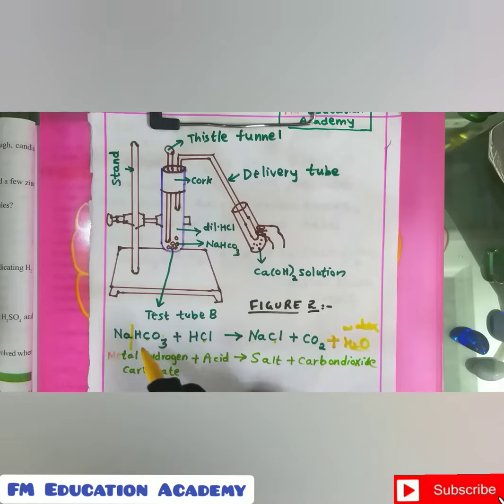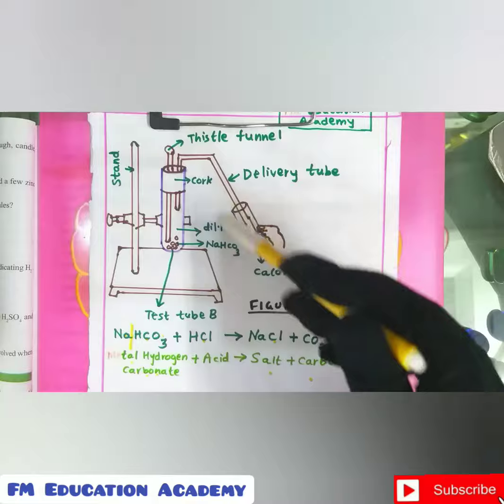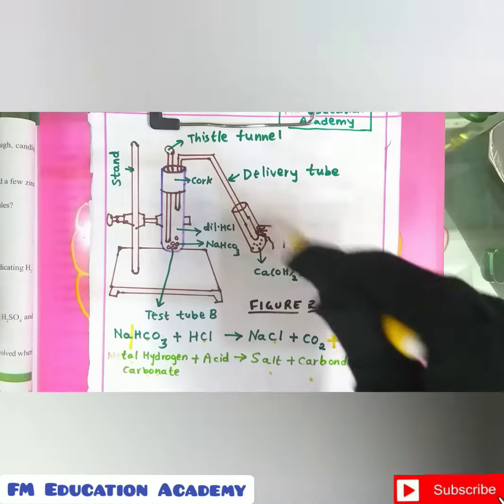So remember, in sodium hydrogen carbonate, sodium stands for metal, H stands for hydrogen, and CO3 stands for carbonate. Whenever metal hydrogen carbonate reacts with acid, when they are taken in one test tube, a salt will form, carbon dioxide will form, and water will form. So until this procedure, I think it is clear. That is what will happen when acid reacts with metal carbonate and what will happen when acid reacts with metal hydrogen carbonate. Now I'll tell you why we are using this calcium hydroxide.